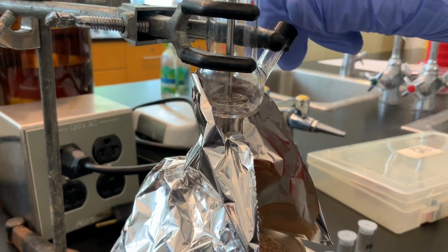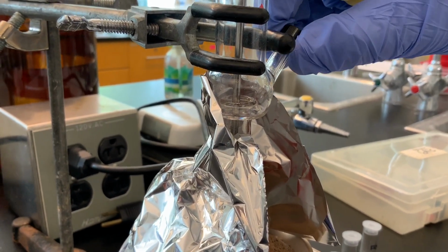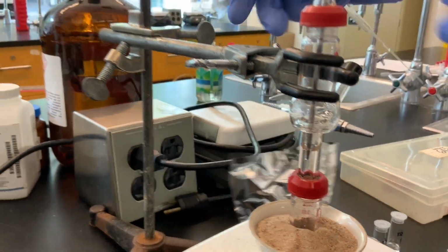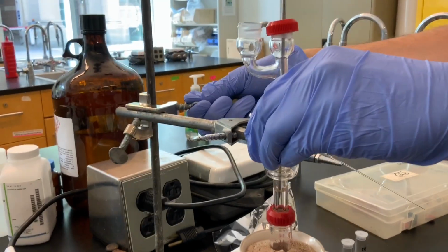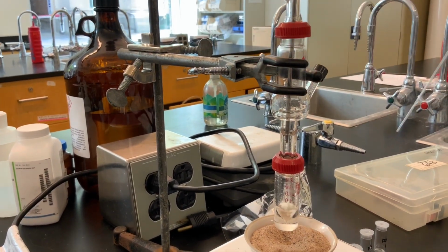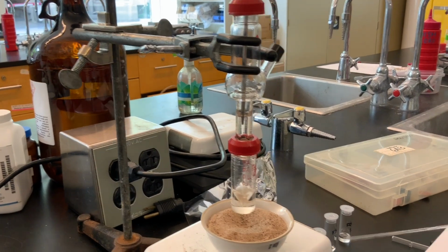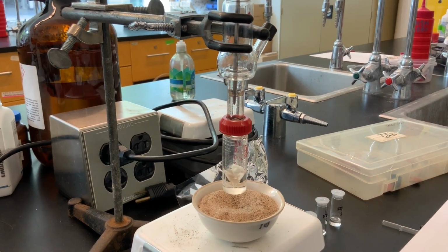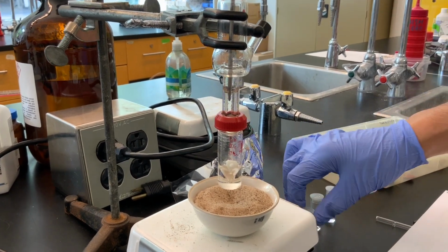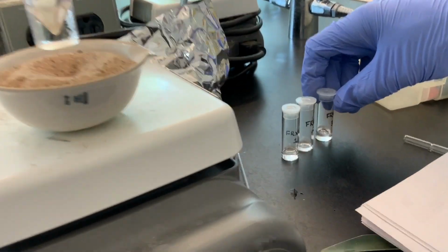And we are done. So we turn off the heat, get rid of the aluminum tent, and I'm going to lift the reaction flask, or the reaction vial, out of there. So we pretty much did a good job at almost distilling all of the liquid in there. And so now we've got our 3 fractions here.